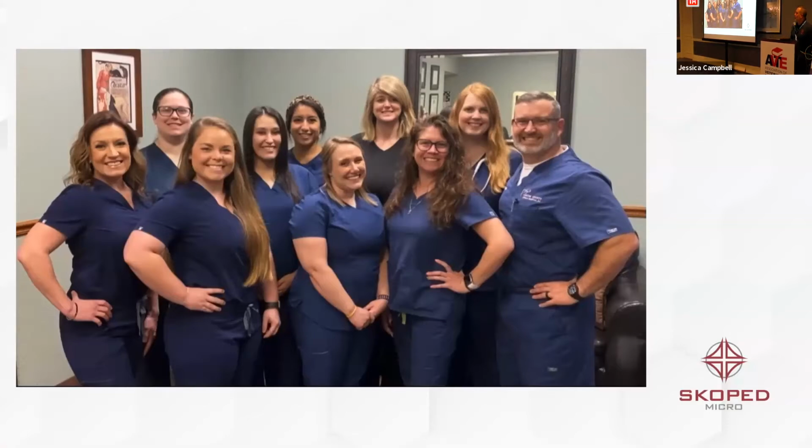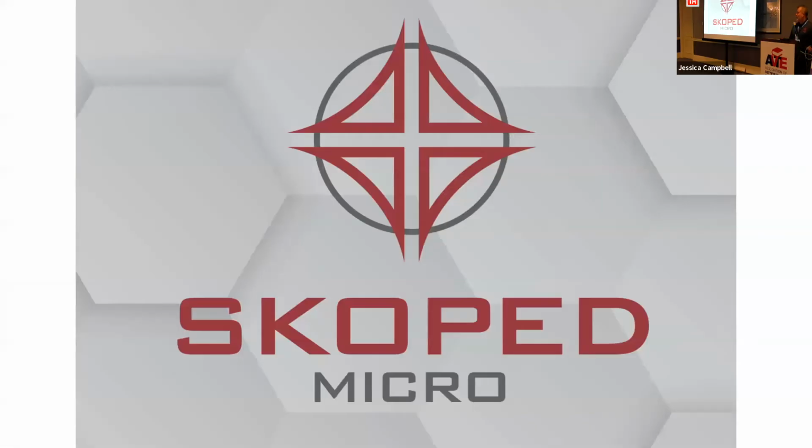So again, we're a 3-doctor practice. And what we're going to talk about today started in this little practice in Southern Oklahoma. I'll tell you more about that. Let's keep on going here. So Skoped Micro. How'd we get here?